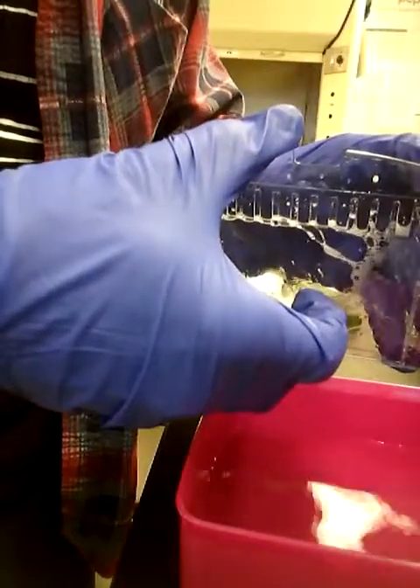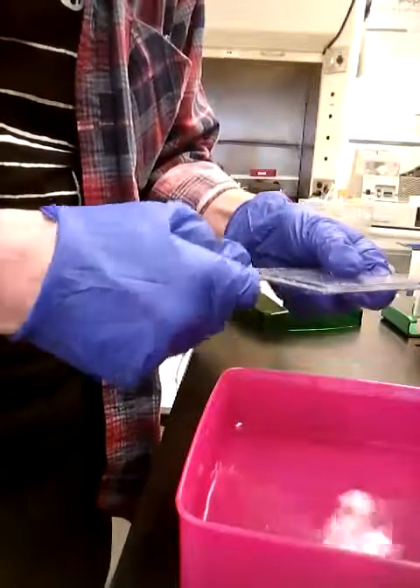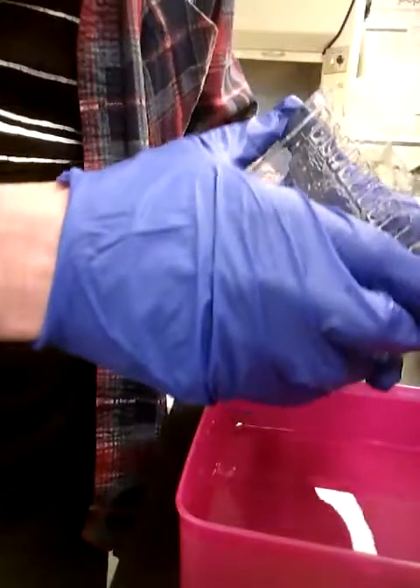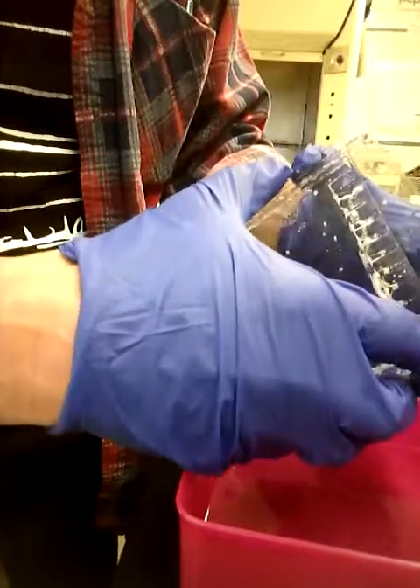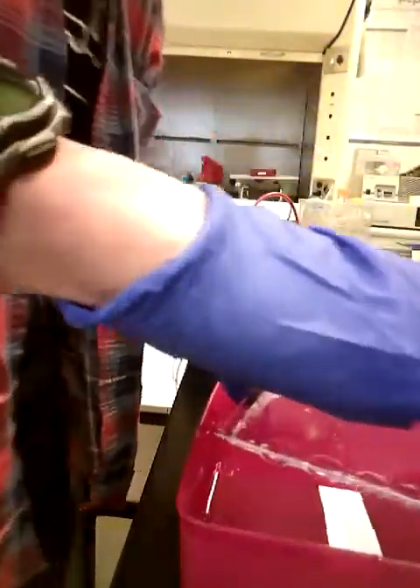And then into a colloidal Coomassie blue stain — a little blue left on here. These Bio-Rad cassettes are pretty good, and usually you only get gel sticking to one plate and not the other.